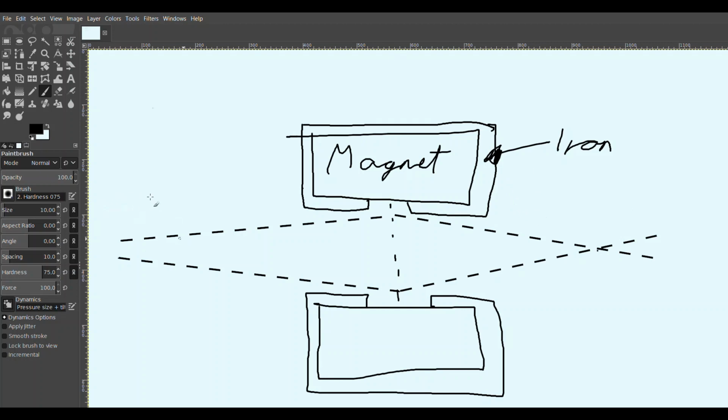The lines are spreading like this, beams are spreading a little bit. The magnets affect moving electrons, and this is definitely moving. And by how the magnet is shaped, it moves all the electrons towards the center. So this is what is happening here.